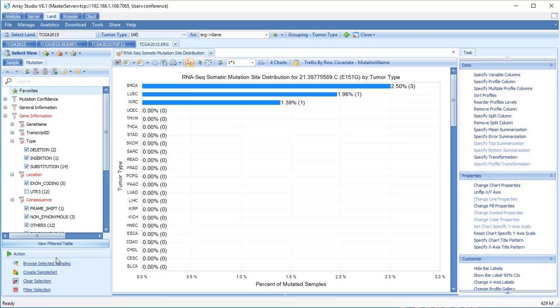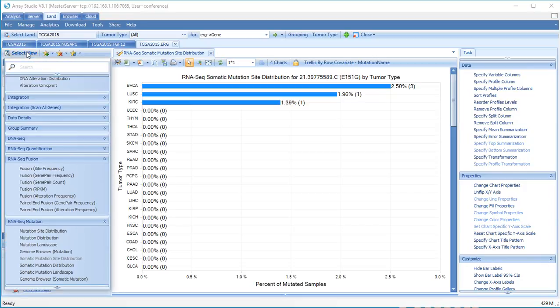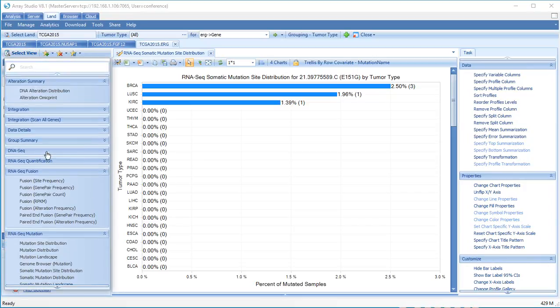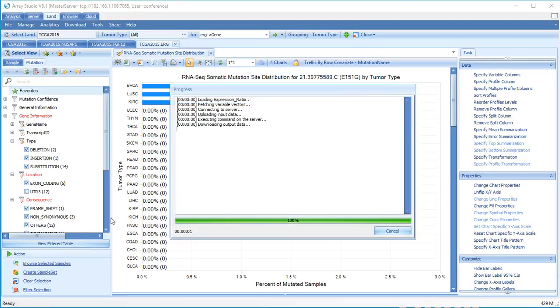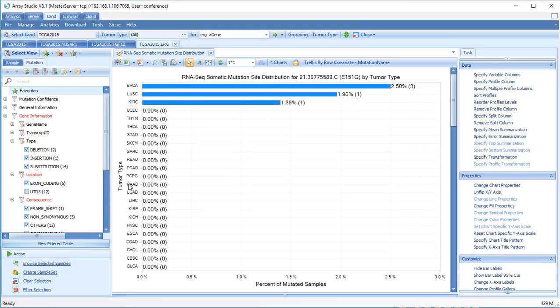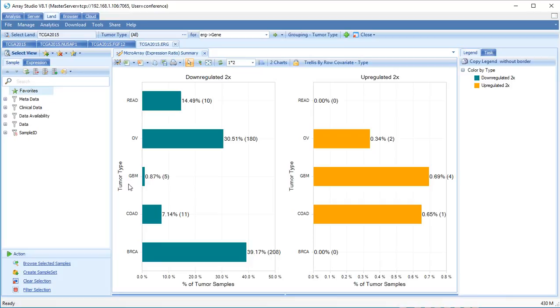Gene expression microarray data also has multiple views, comparing tumor and normal samples to a universal reference set. A small number of genes, such as BRAF, have protein array data.